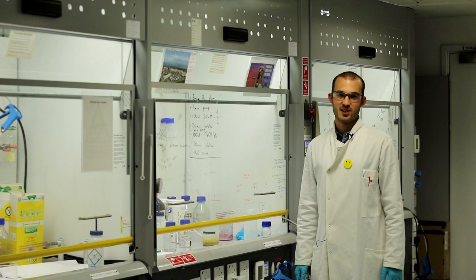Hello, my name is Alaric Taylor and you join us at University College London for an introduction to the Langmuir Blodgett technique.